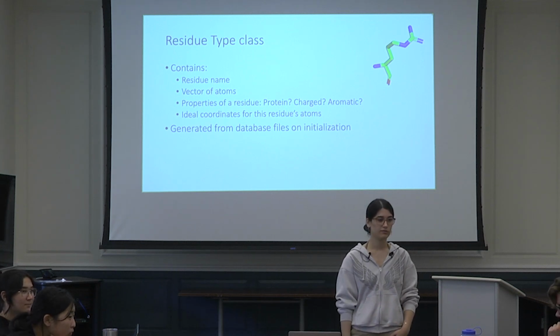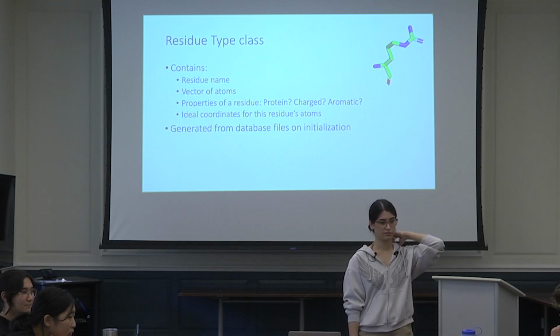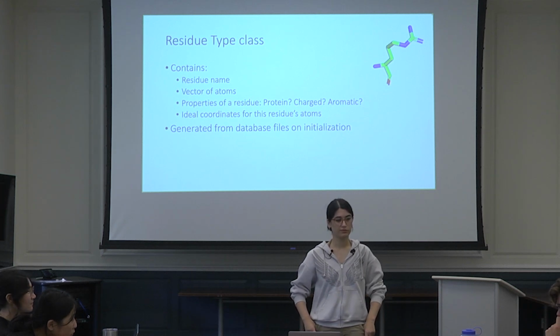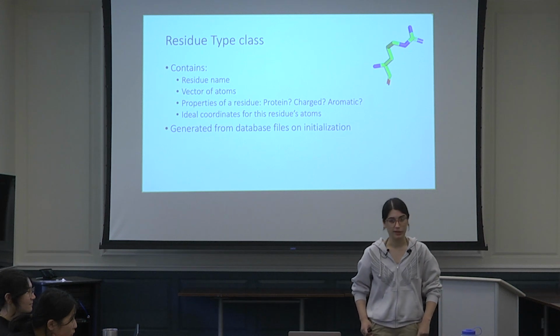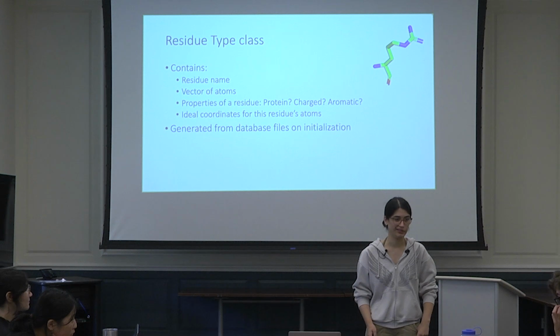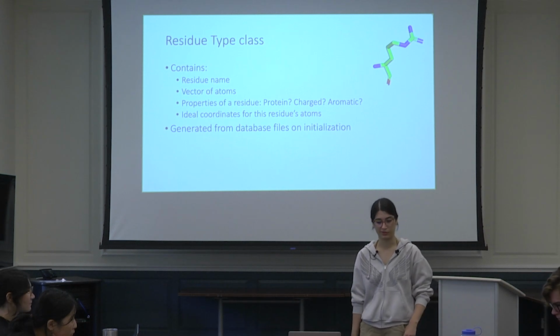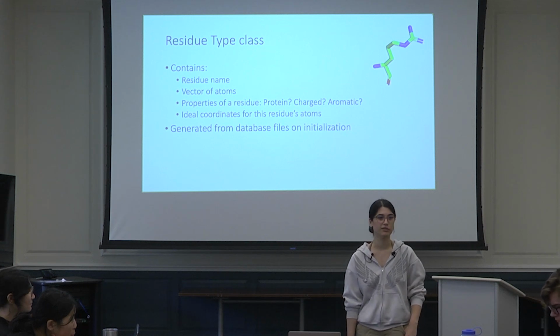Calculations, I think computation, under some conditions, maybe make approximations of others, but these are not necessarily true in every context. So that could cause some deviation from what you calculate and what is maybe captured. Yeah, so we can have some less than ideal constraints applied onto a protein structure and then make some perturbations that cause it to look different than ideal.